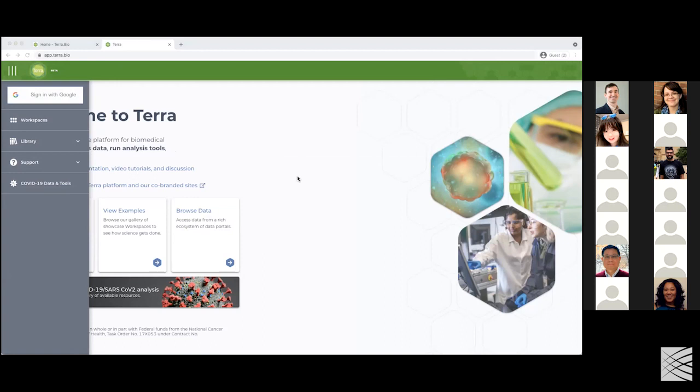Click and sign in with Google. It's going to show me my account. And now I'm logged in with my credentials. And again, message our TA Tiffany if you're having any trouble getting into Terra.